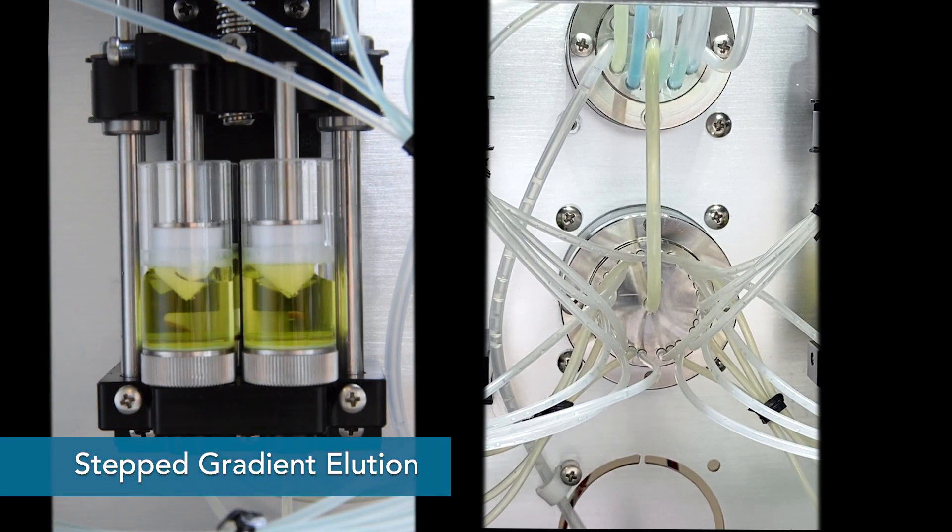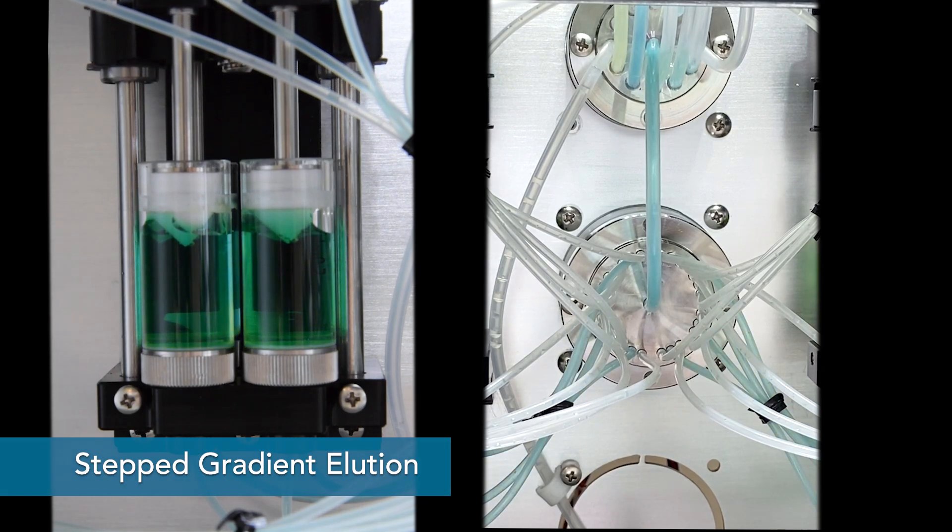If more than 9 buffers are required, step gradient elution can be performed by mixing 2 buffers.